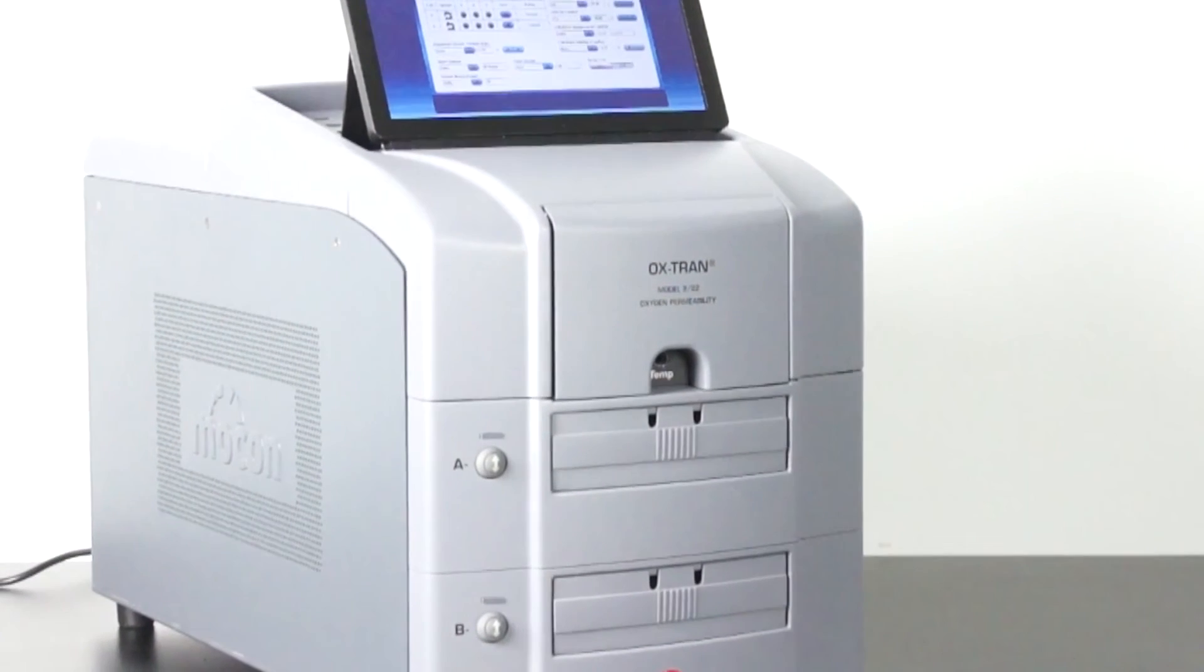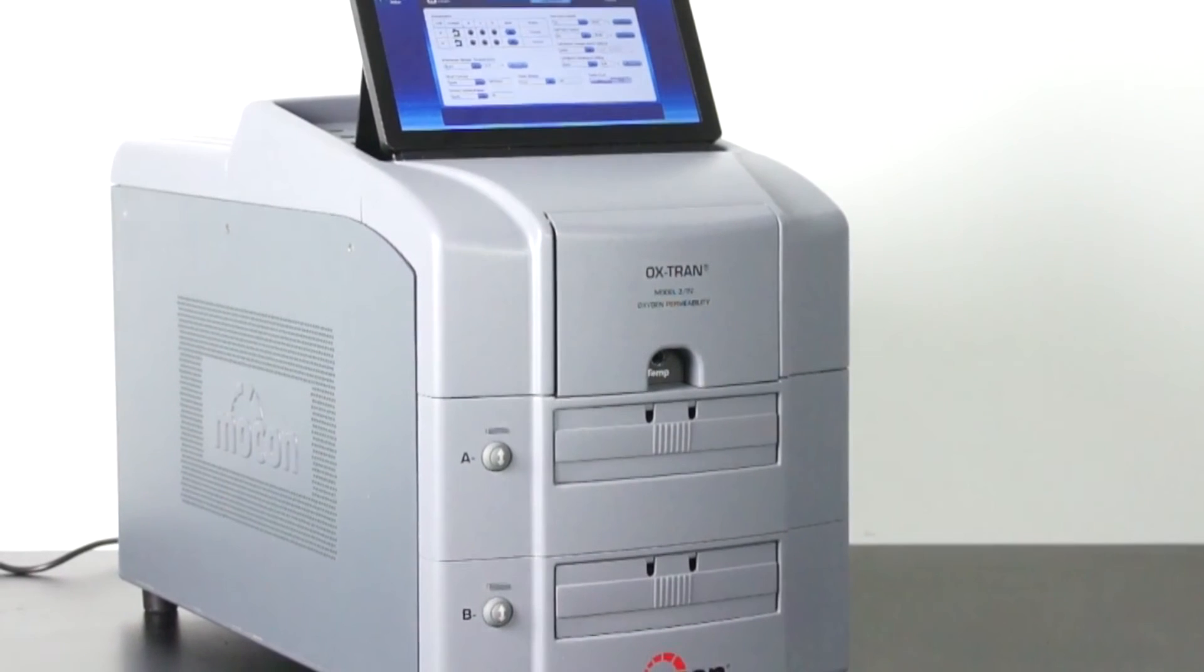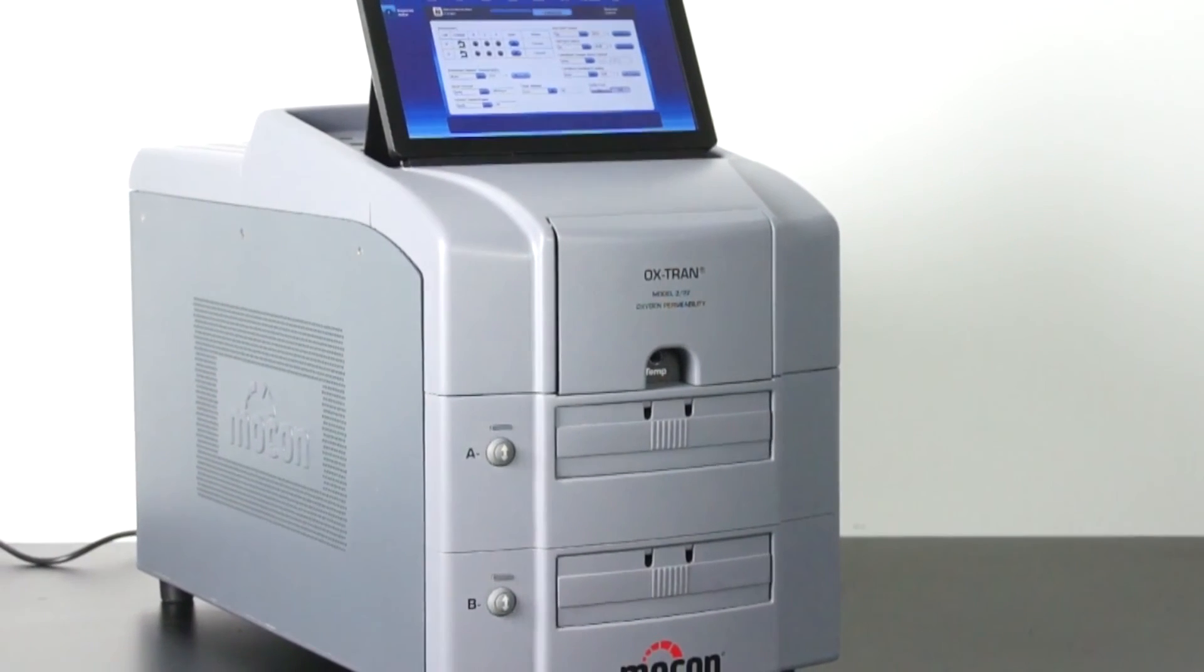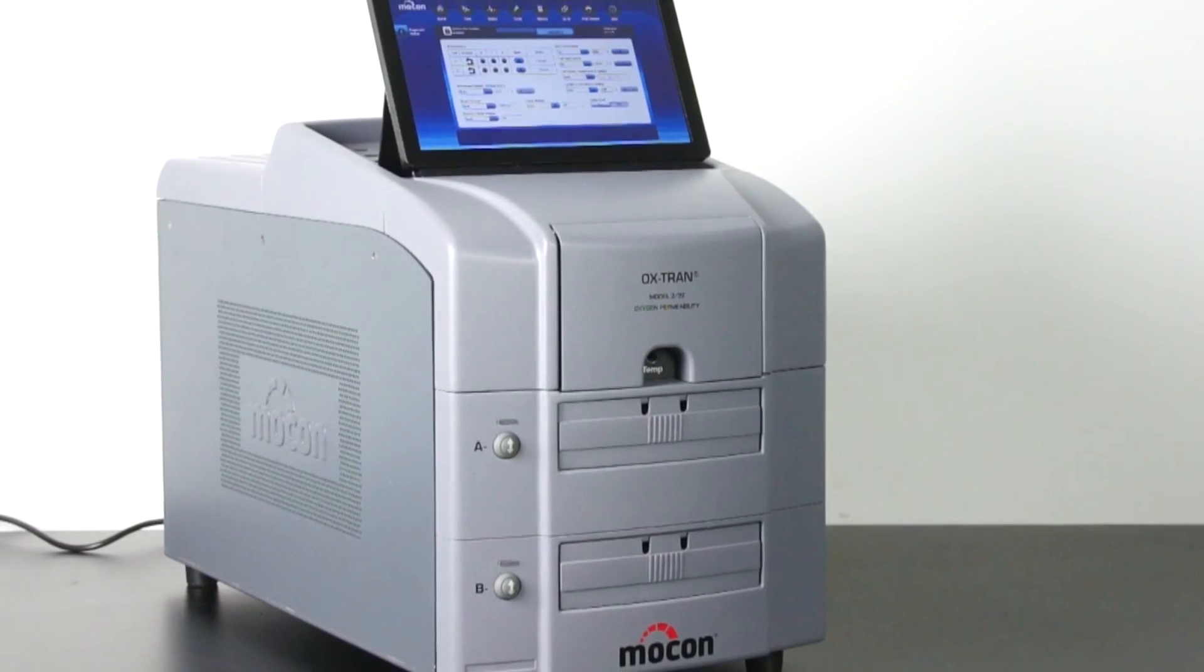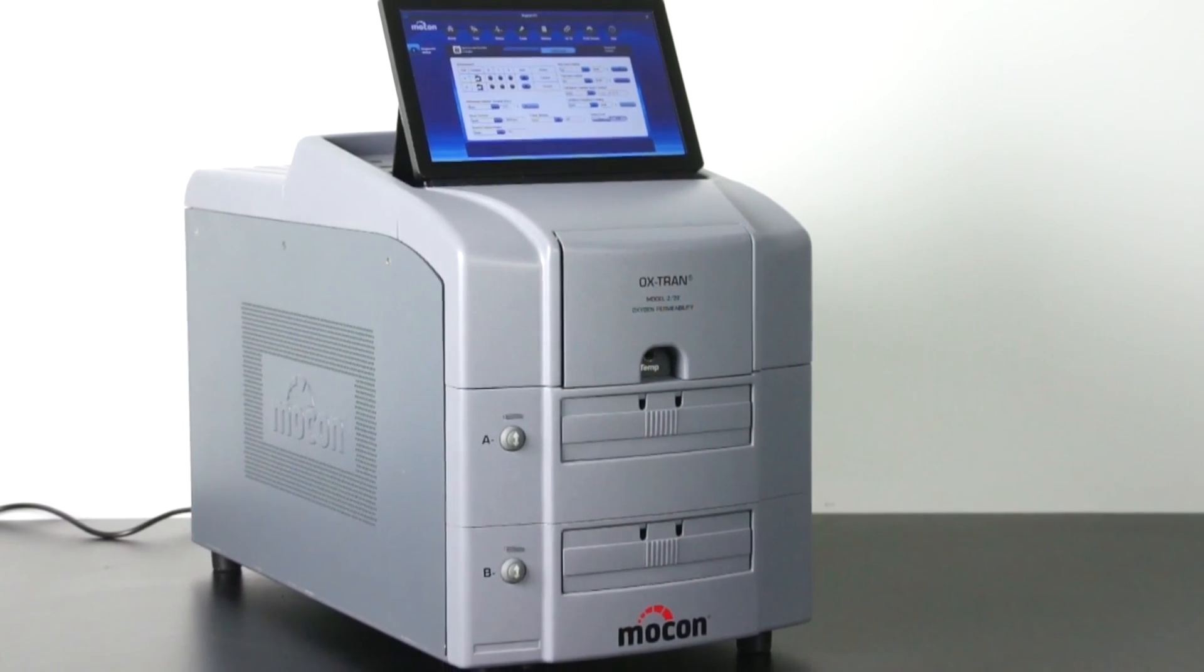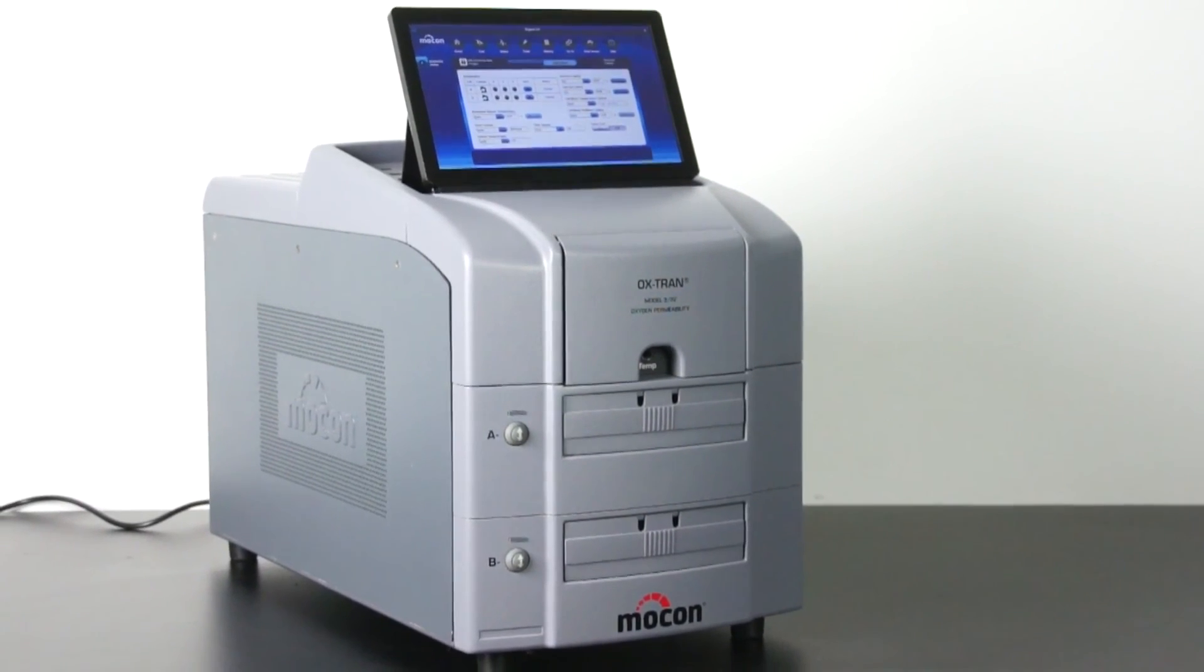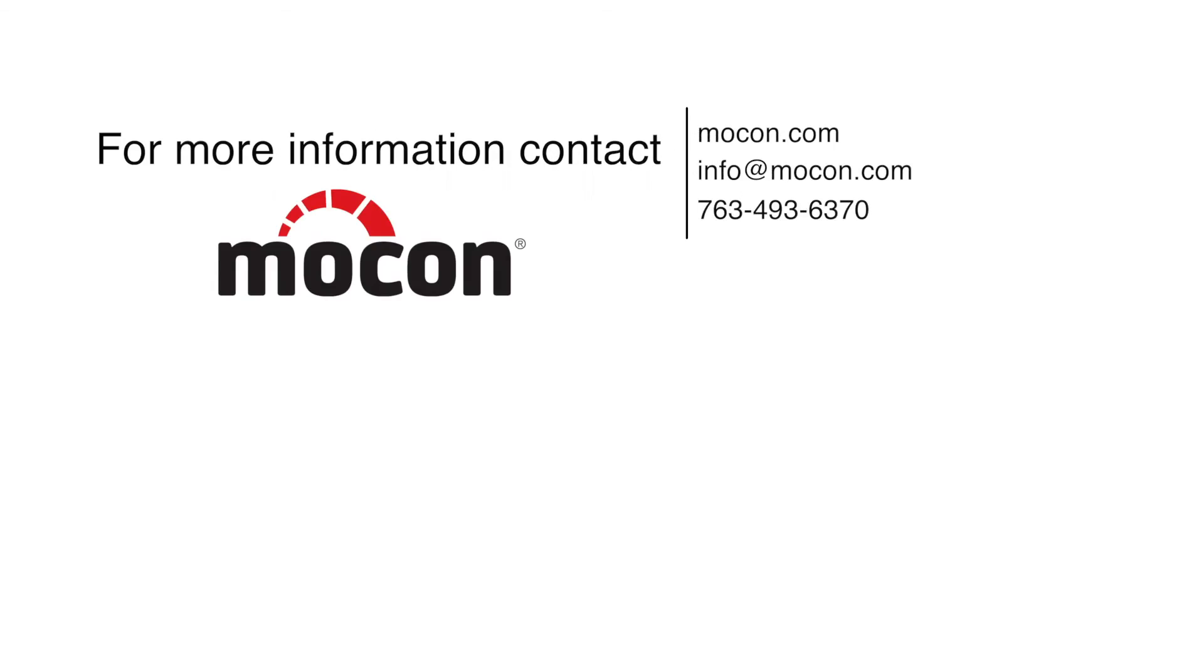Ethernet-ready capabilities enable you to connect this instrument to your corporate network and use the optional PermNet Lite software. An operator can view and operate the instrument from any computer on the network exactly the same way as if they were standing at the instrument. For more information, go to MoCon's website at www.mocon.com.